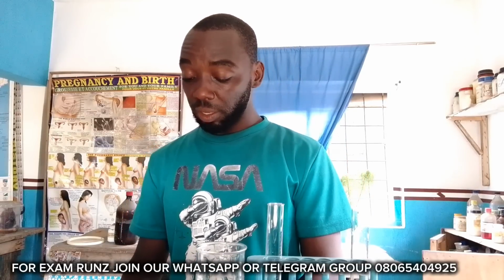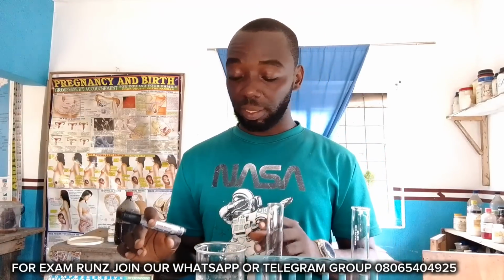Okay, so on this, I want to do one of the most interesting parts of this practical. If you are a teacher, if you are a student, I want you to pay attention to this video. For now, I'll be dwelling on specimen G and specimen H. If you look at it, specimen G says fresh egg, and here we have our fresh egg labeled G.